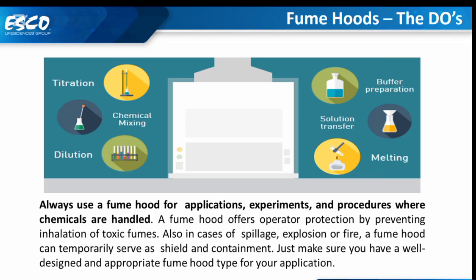Also, in case of spillage, explosion, or fire, a fume hood can temporarily serve as a shield and containment. Just make sure you have a well-designed and appropriate fume hood type for your application.